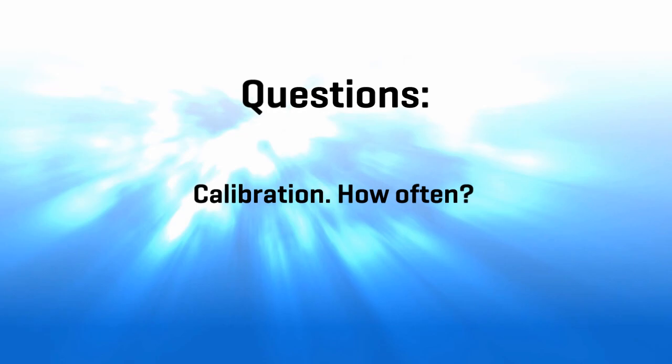The first one is calibration. How often? It really depends. It depends on what kind of testing you're doing.